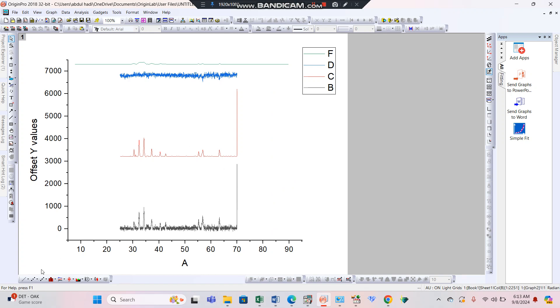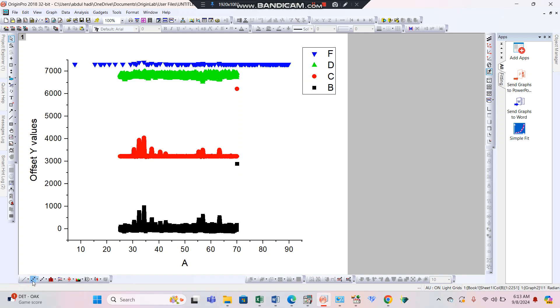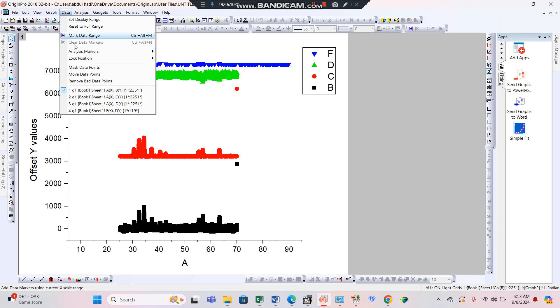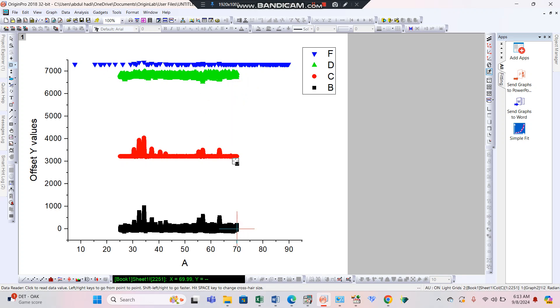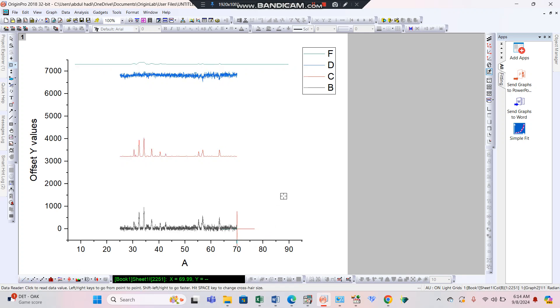Here you can see one data point that is creating an outlier. You can remove bad points using the remove bad points option — remove this point and also remove this other point. Now draw a line graph again and you can see the improved view.